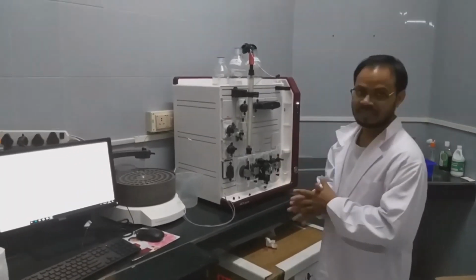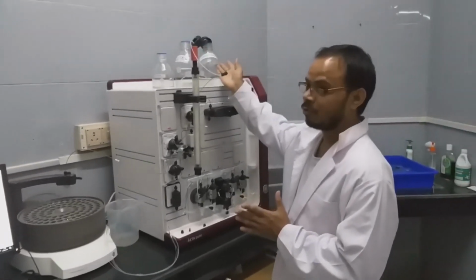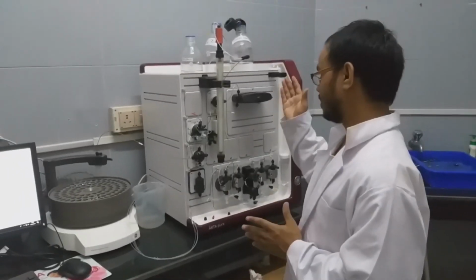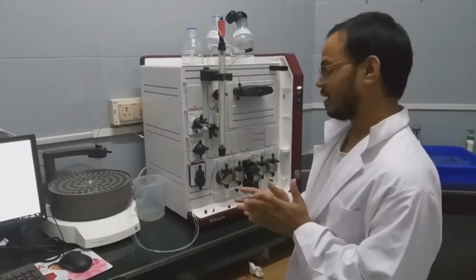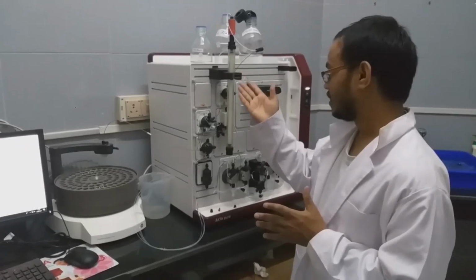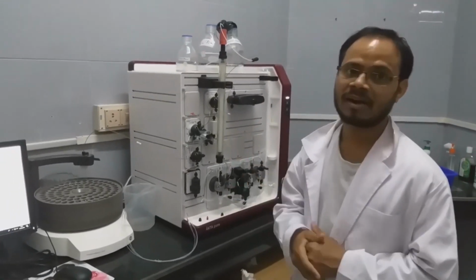Now we understand how fast protein liquid chromatography works. After using the instrument, we have to change the valves from buffer to water, because if you directly keep the column in 20% ethanol, the ethanol may cause the buffer, proteins or salts present in the column to precipitate and clog the column.